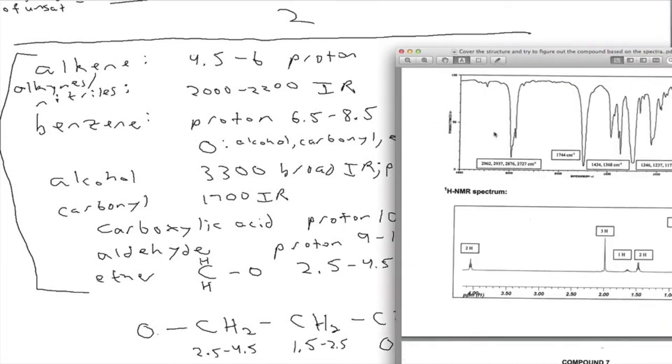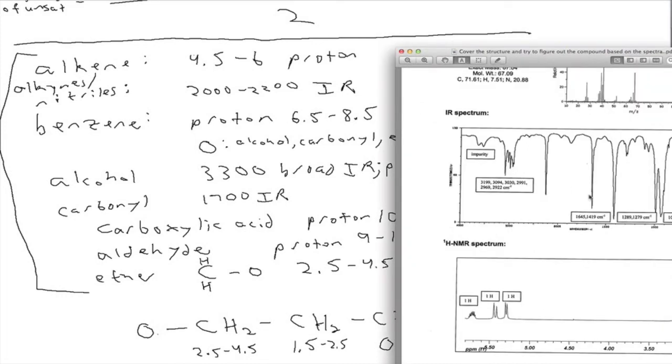I think one reason why it would be difficult to notice that is I noticed that in this spectrum, most of the peaks are labeled with actual numbers. This one was easy to ignore because it didn't get a label. But even though it didn't get a label, that didn't mean it wasn't helpful. It still was helpful to pay attention to it.